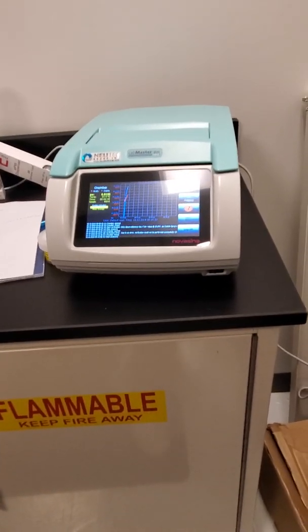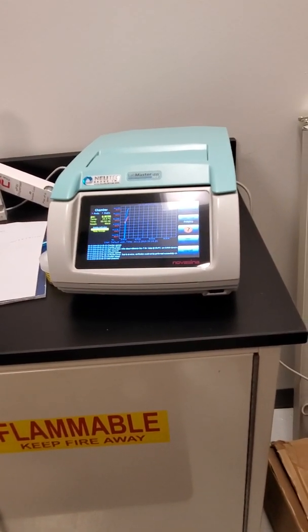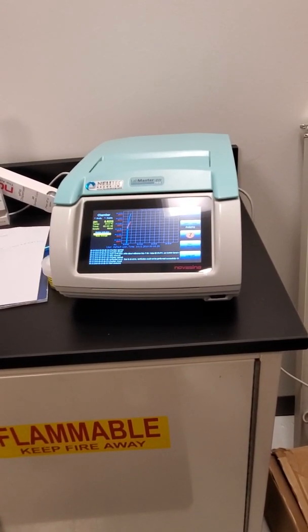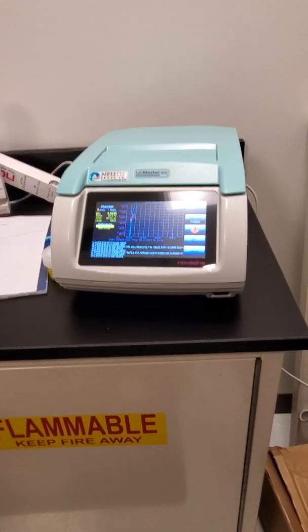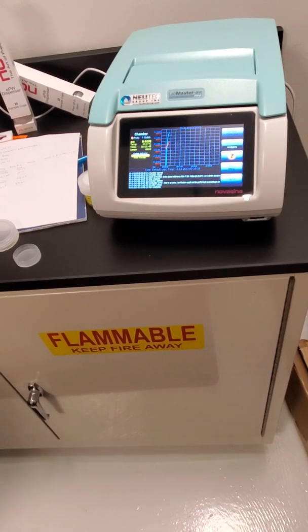Do you usually log in with a certain account? You can set up logins. You don't have to, and it defaults to not. But if you do want to control access, you can go in and set those up, and that's detailed in the manual.